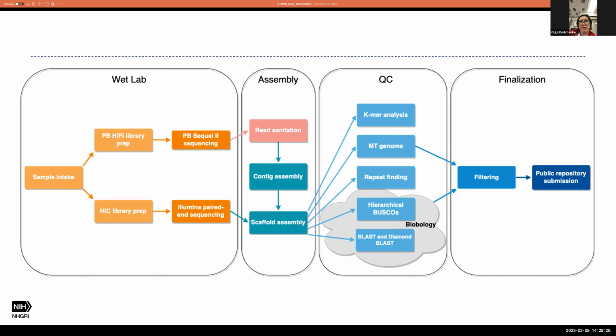Yeah, in our case, though, if we're doing tiny little bee genomes that are 300 megabases, now we could put 5, 6, 7, 8 of those on one cell and potentially get all the genomes back. Do they have a demultiplex option? They have barcodes of sorts. I think 16 barcodes that you could, essentially when you ligate on your adapter, that contains a very long barcode.